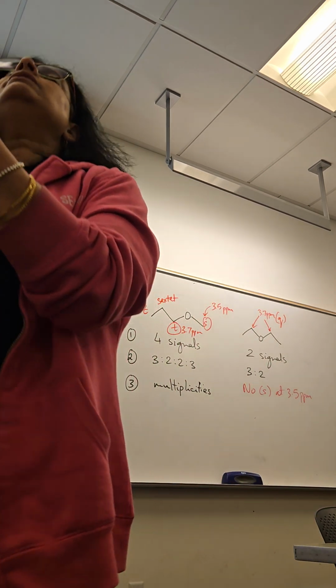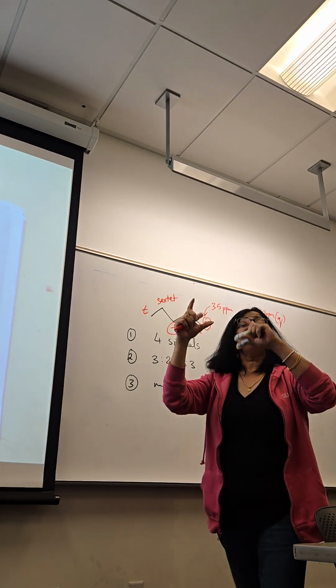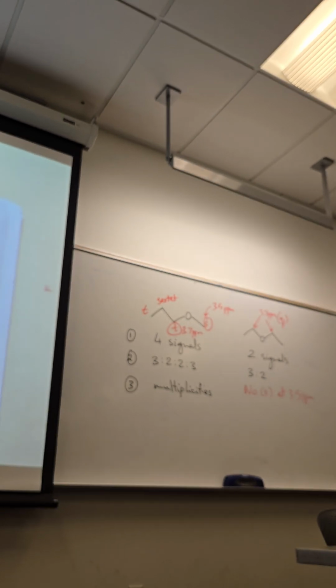So what we are doing here, guys, is we are looking at the structures of the 2 compounds and trying to find the differences between them so that we can then say, okay, that will help us identify which compound the spectra belongs to. Make sense, everyone? Yeah? Okay, then what about the next one? Let's do number 2.